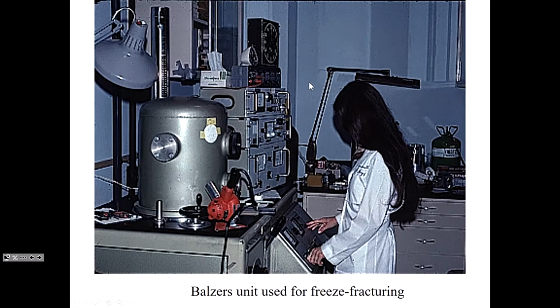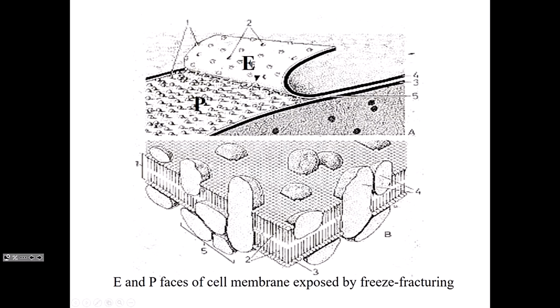Okay, another type of microscope, another type of imaging that we can use is freeze fracture, where we take a piece of tissue, we freeze it, and then we whack it. And what that's used for is looking at the structure of the plasma membrane. So the plasma membrane, which we will learn more about on Wednesday, is a lipid bilayer with proteins impregnated through it and around it. So if we split this plasma membrane in two, the external face is the face of the plasma membrane touching the exterior. That's the E face, external face.